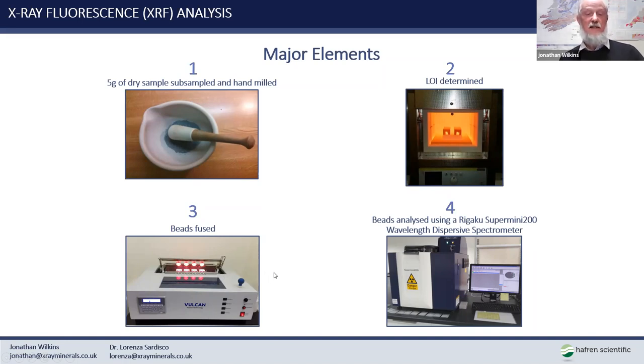And of course, the thing that goes wrong is if somebody forgets to put a crucible down there, because then the molten contents of the crucible is tipped into the gas burner, and you have a big clearing up job to do. Great shame.